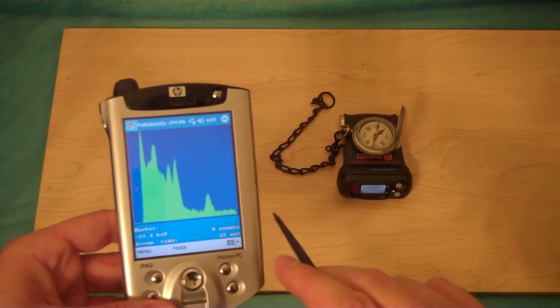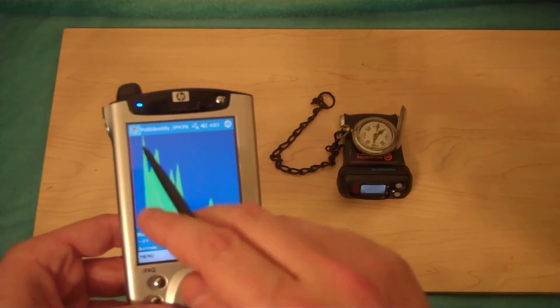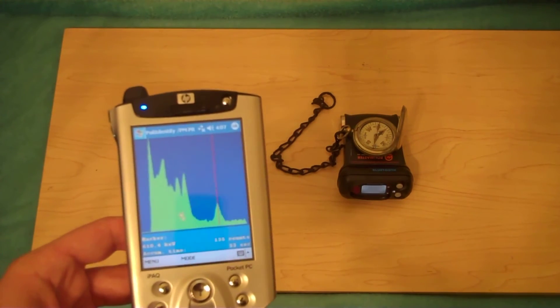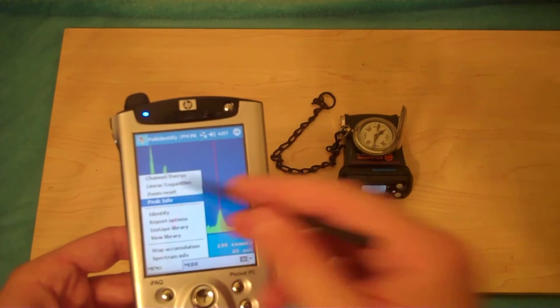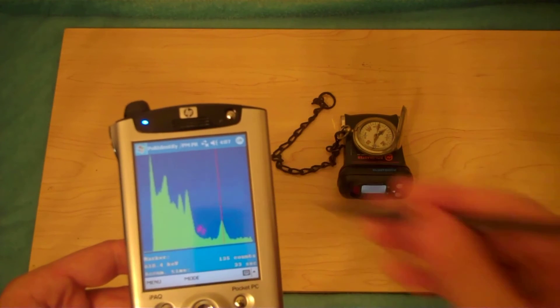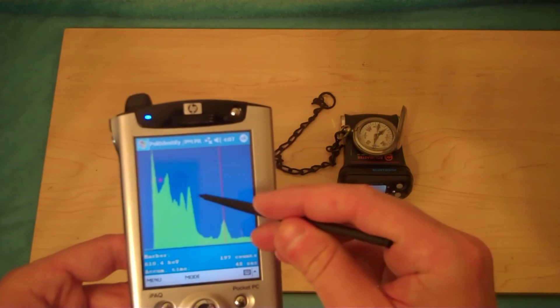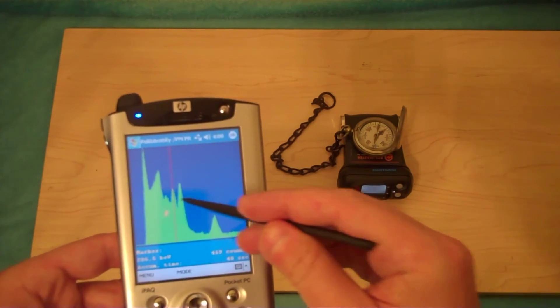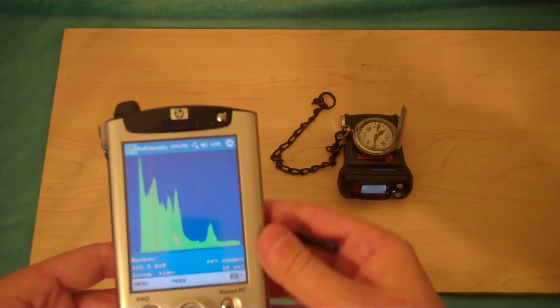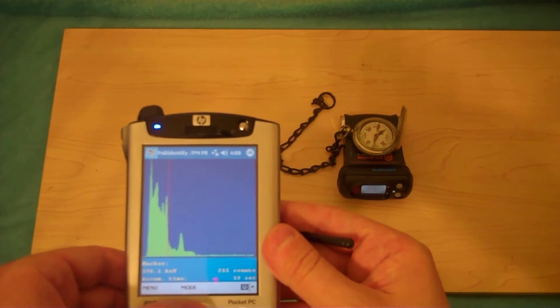Right off the bat, if you look to the far right of the actual spectrum, you can see bismuth-214, and that's one of the dead giveaways — it also tells you how old the sample is. Looking at the peak information, you can see it's almost dead on for 609 keV. It'll get closer and more accurate as time goes on. And there are the lead-214 peaks. The x-axis at the bottom is energy from left to right going from low to high, and the y-axis is the number of counts in each channel.